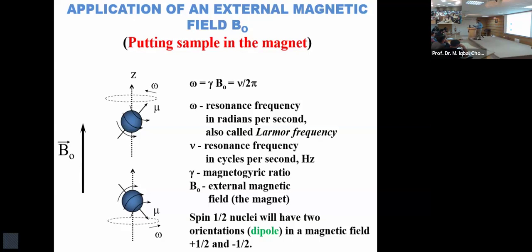right? And that is the reason if you have 3,000 protons in your sample, you could have theoretically 3,000 peaks, unless they are magnetically equivalent, because they would have 3,000 different types of precession. Okay, if you have 30 carbon-13, the 30 carbons would have a different electronic environment, and they would have different B effective.